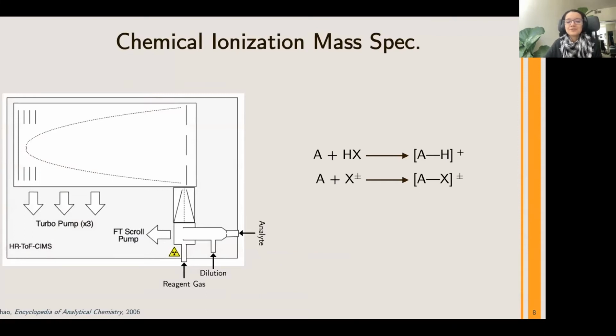One of the most popular tools is chemical ionization mass spectrometry, or what we call CIMS. This is because the CIMS is able to measure these compounds using a soft ionization technique that ionizes the chosen analytes using a specific reagent gas. Mass spectrometry in general has a fairly low detection limit. And in the atmosphere, the CIMS has been shown to be capable of measuring atmospheric species down to parts per trillion levels, so quite tiny.